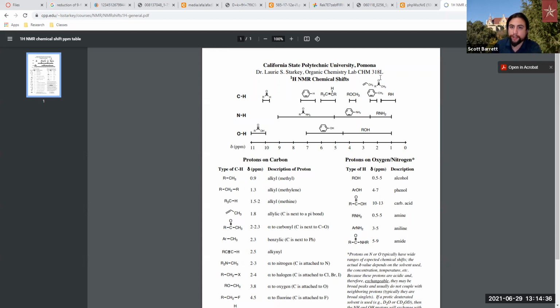So the ketones as well are going to be all the way down here because they're shifted up there due to the fact that they are farther away from the carbonyl group itself, versus where you have your aldehyde directly bound to your carbonyl carbon and your hydroxyl group bound to the carbonyl. However, hydroxyls are more commonly found at the higher end with regards to the dipole moment, especially on the carboxylic acid here. And then finally, if you have any sort of free-floating hydrogen that's just bound to an alkane, it's going to be extremely low. So the alkane will be over here around the lower point, up to 1 and near 2.